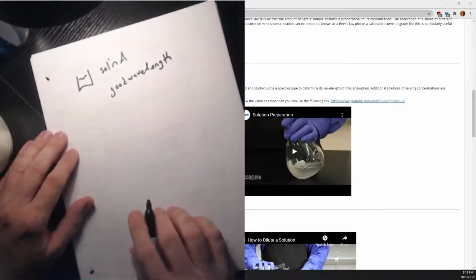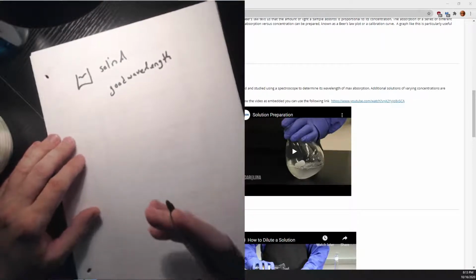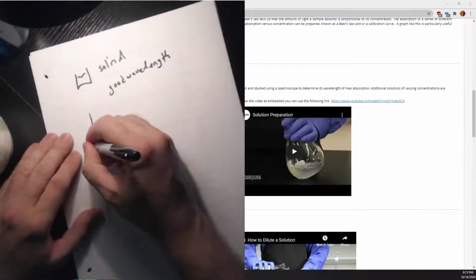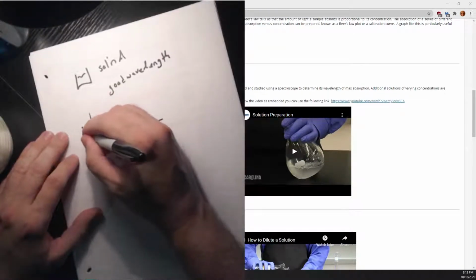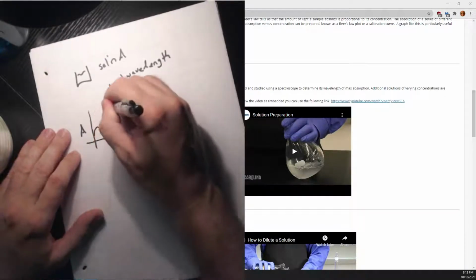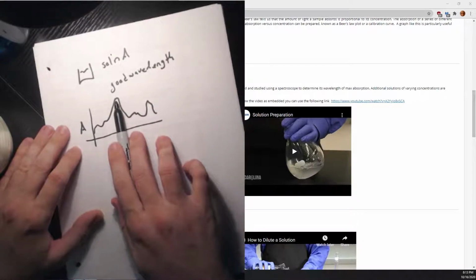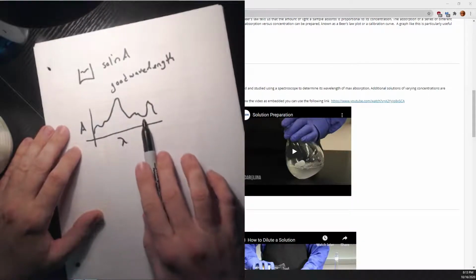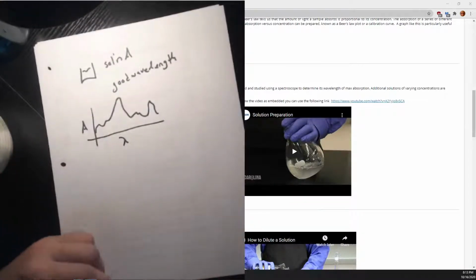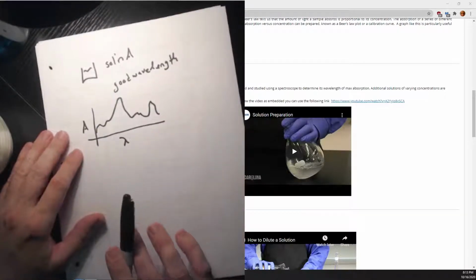See, a material will absorb different wavelengths of light, better or worse, more or less. You measure absorption against wavelength, and you'll get something like this, where it might measure really strongly at one color of light or very, very weakly at another color. You would not have a device that would create a really good spectrograph like this.